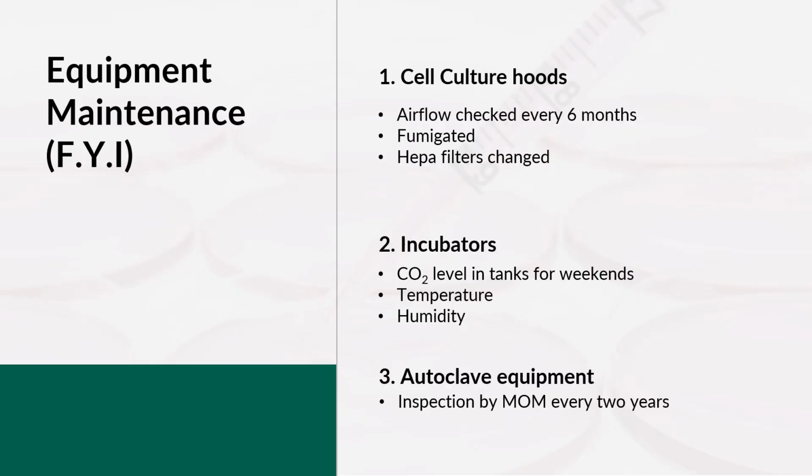They are used to provide us a sterile work environment, particularly when you're handling hazardous materials or working with any sensitive samples. So this regular maintenance ensures that the cell culture hoods function properly and provide the necessary protection for the laboratory personnel, the environment, and also the cultures that you're working with.